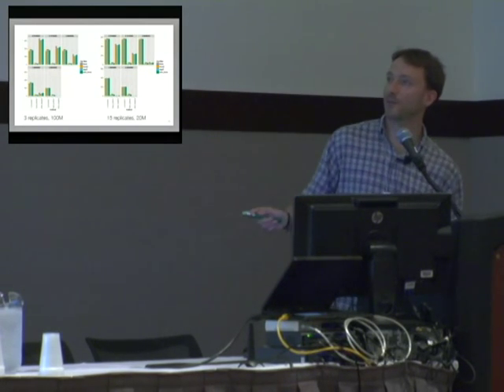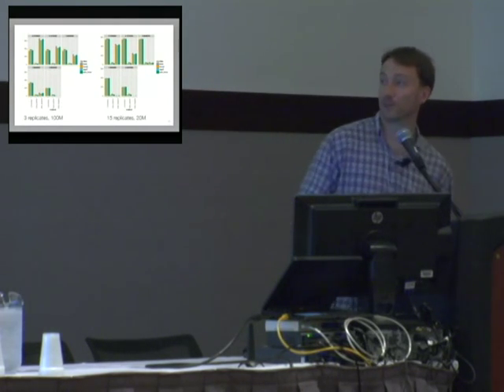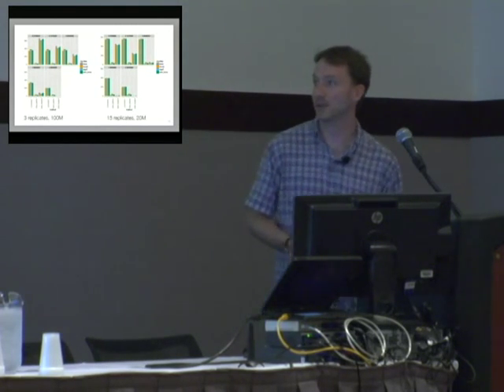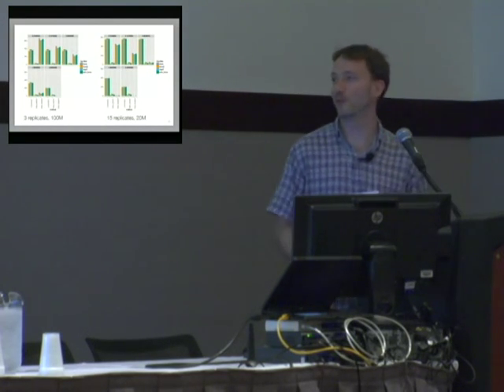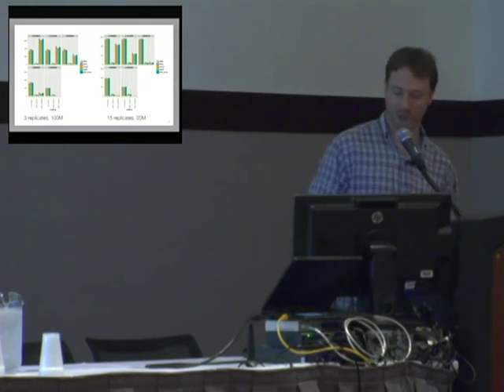So at 3 replicates, you can see that you don't get all the 2-fold changes, and you kind of top out. You don't do much better at 1.5-fold changes. But if you have the same number of reads and you do 15 replicates instead of 3, you can get almost all the 2-fold changes and a good amount of the 1.5-fold changes. So this is another example of the usefulness of having something that you can plug into your analysis pipeline and generate some results on simulated data.